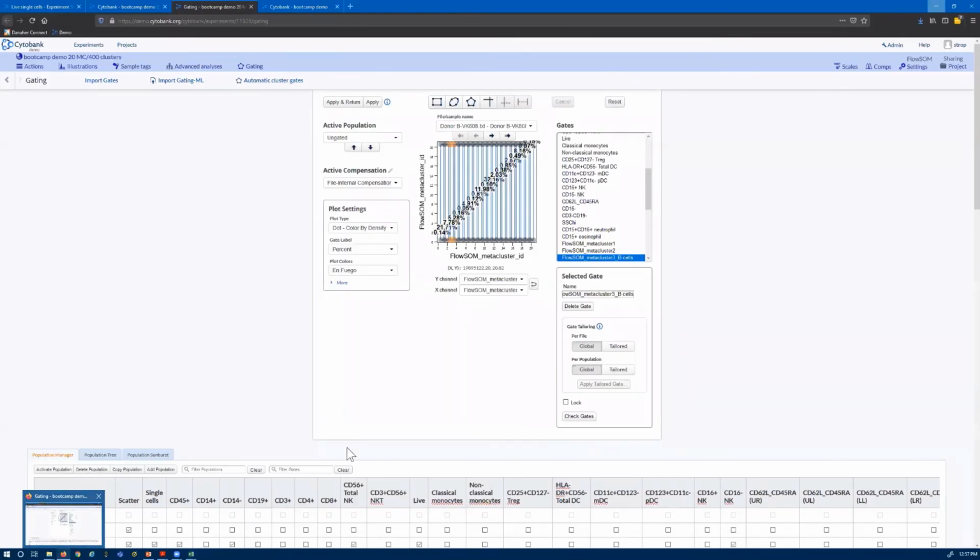That's a great question, because it is a strategy that we recommend if you see that clusters or metaclusters really look like each other.